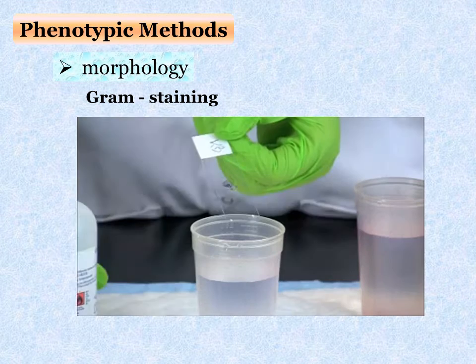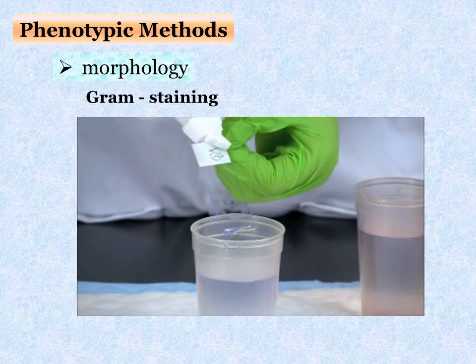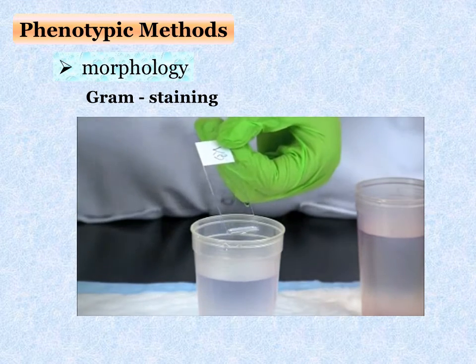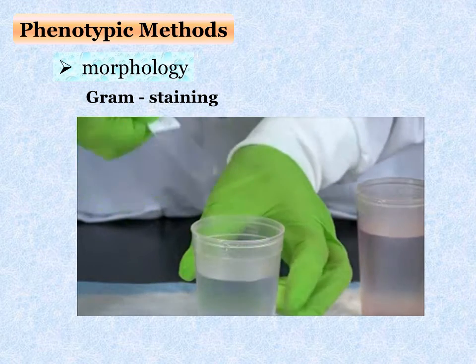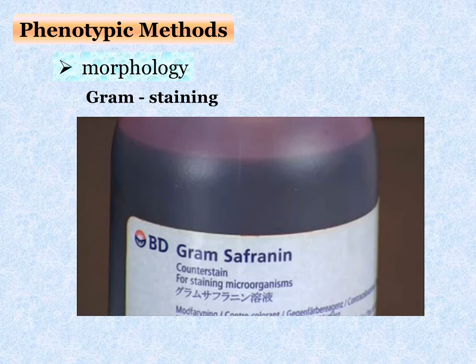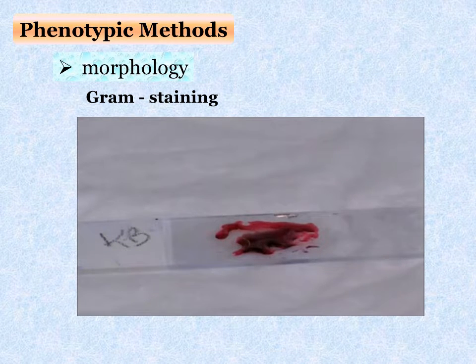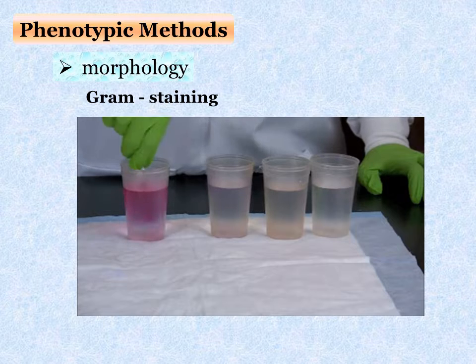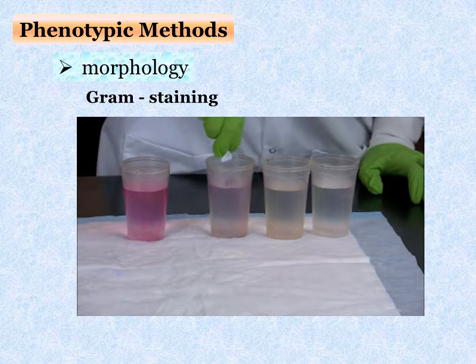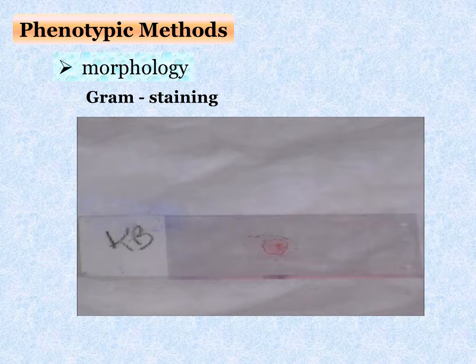Add a gram stain decolorizer and rinse again with distilled water. Counter stain using safranin. Rinse with water. After the slide is completely dried, observe the slide under the microscope.